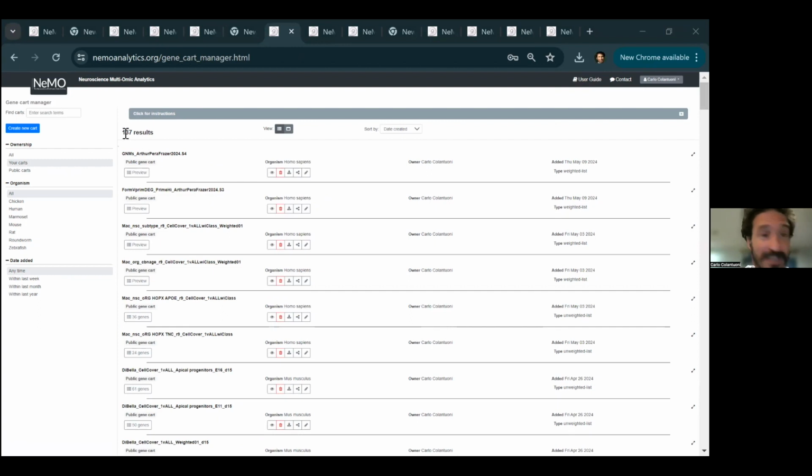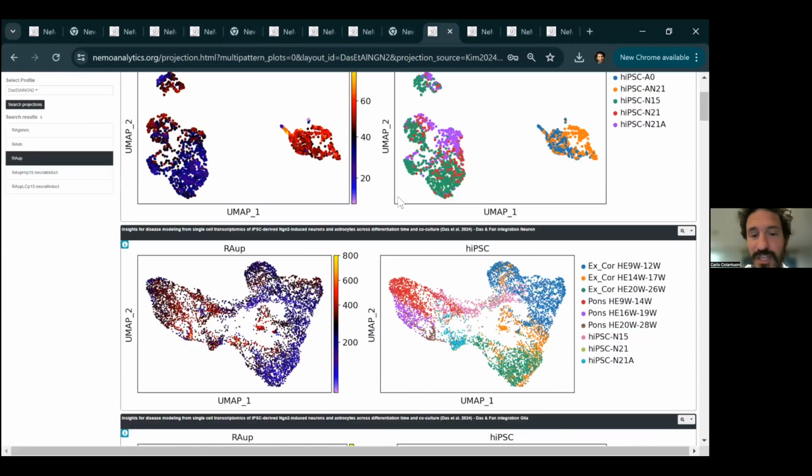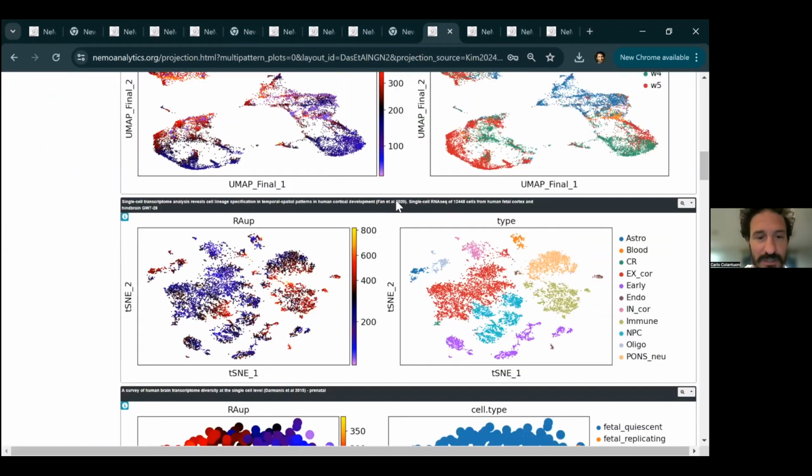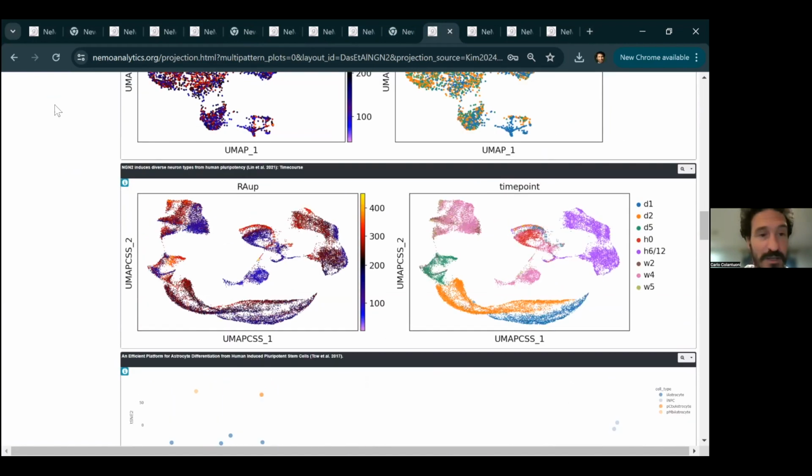So I have brought in 137 different gene lists. And in fact, I think I have data up for one of them here. We can flip to this one. So this is Hsiu Chuan's NGN2 data from some time ago, but now it isn't colored by a gene, it's colored by retinoic acid induced genes. So a gene list from a totally different study.